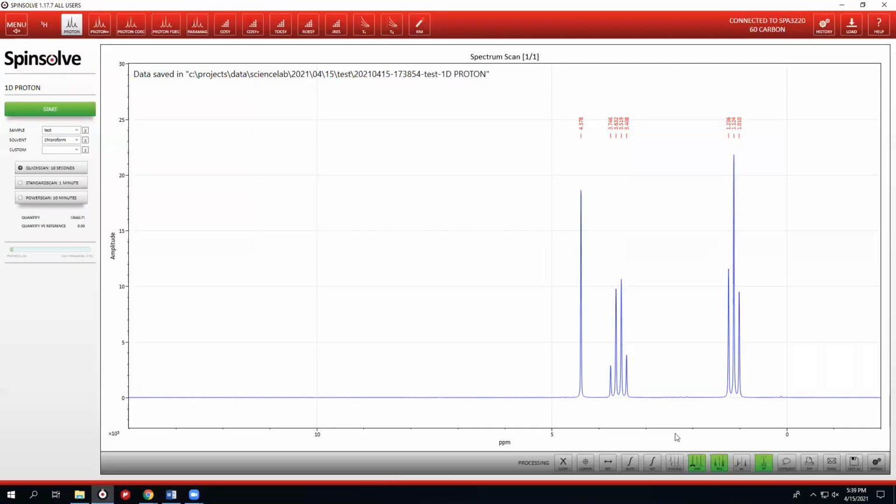So let's come back, see our NMR. We have 3 protons, 2 protons, and 1 proton here, but they're not integrated. So you're going to go to INT, integration, or you can use auto. AUTO, auto. It will automatically integrate and label the peaks. So let's go ahead and click auto. You see, now these peaks are integrated and the numbers are listed in this table.